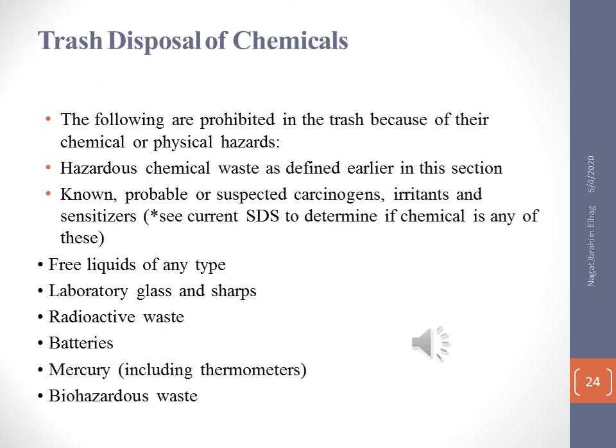Trash disposal of chemicals depends on the type of chemicals. As I mentioned before, each chemical has an SDS, or safety data sheet, and we have to read it carefully to know what type of hazards that chemical will cause, and what type of hazards will result from the waste of these chemicals.